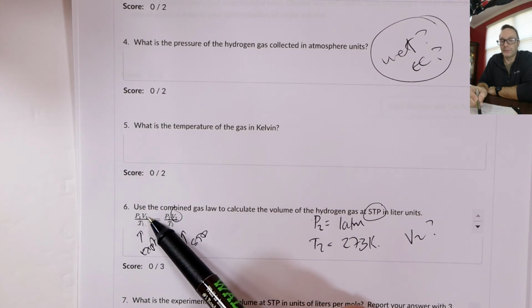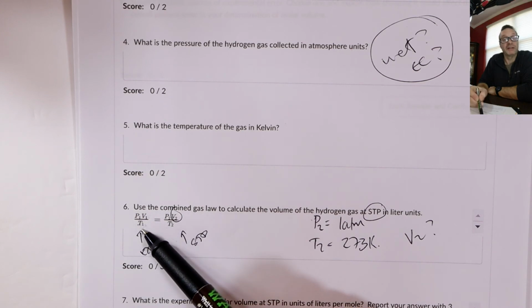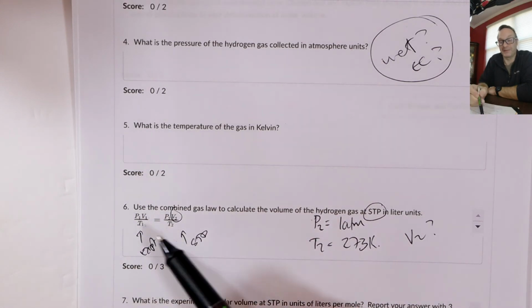So, 0.149 is 149 milliliters here, yeah? Temperature, lab temperature, pressure. Remember, that's the pressure of the hydrogen, not the big number, the difference number.